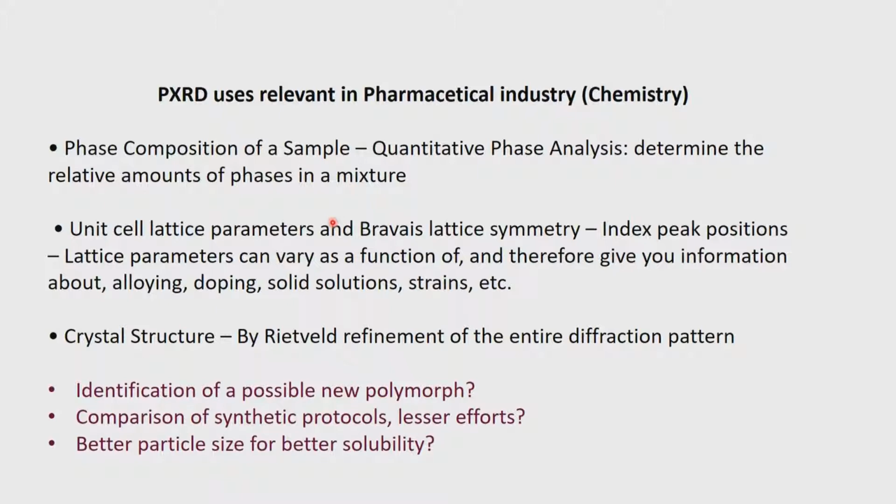One can also determine the crystal structure by what is known as a Rietveld refinement, about which we will spend a few minutes as we go along. And this is the refinement of the entire diffraction pattern. See, when we make an analysis and identify a phase and then we want to doubly verify that it is a single phase, the best approach is to always use the whole pattern, the complete pattern, rather than use patches of this reflection, that reflection, and so on.